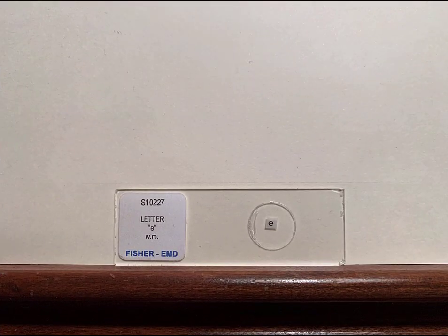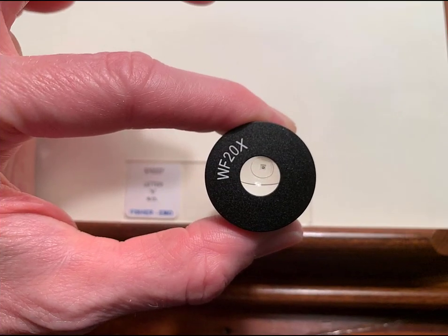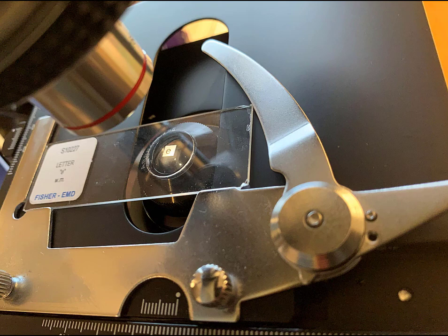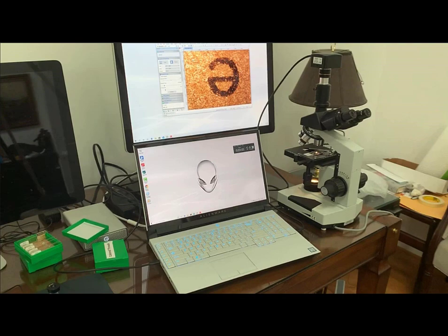Probably one of the best ways to demonstrate this effect is by using our slide with the letter E. Here we have one of the ocular lenses from our microscope, and if we zoom in on it, you can see that the image is indeed flipped upside down and backwards. Now let's view our letter E under the microscope — and sure enough, it is upside down and backwards. Our camera view shows us the same thing.